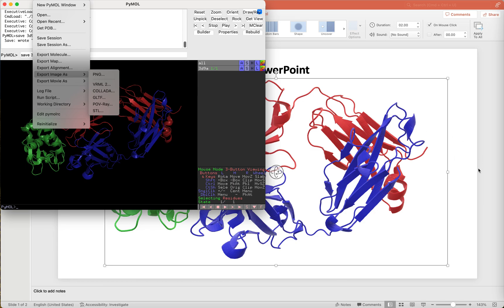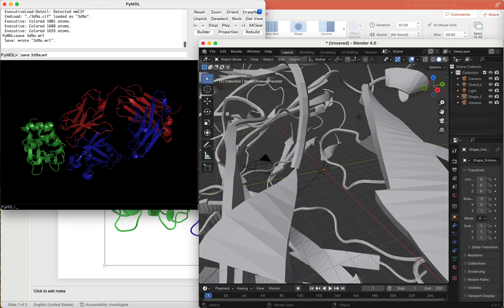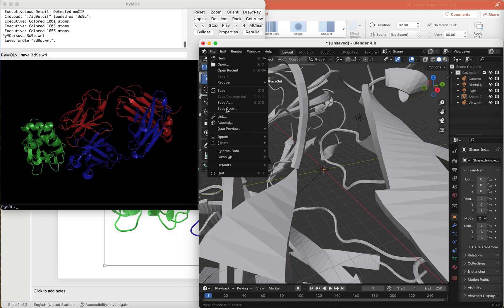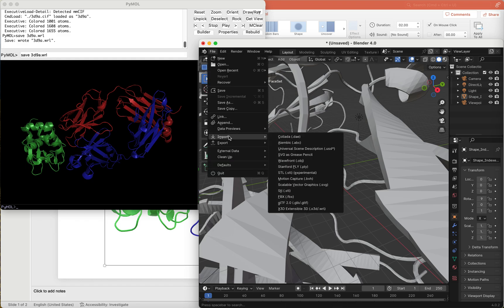This new file is then read into another program called Blender by choosing File, Import, and then the last option.